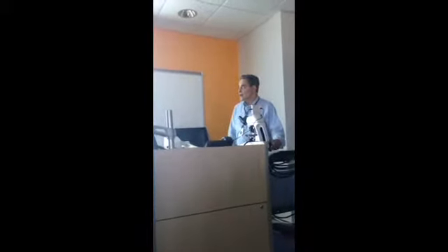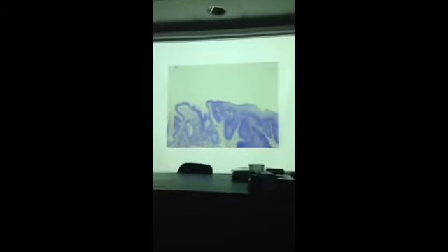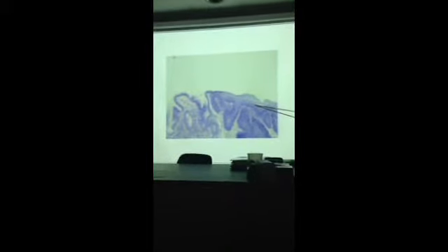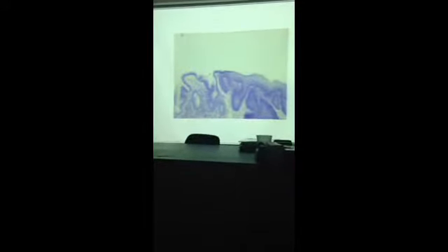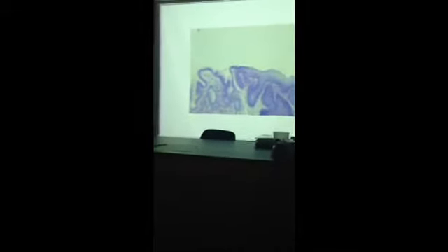Okay? All right, so here we have the junction between the esophagus and the stomach. And this is where we see the change in epithelium. On the right, what kind of tissue? Non-keratinized stratified squamous, like we saw lining the tongue in the oral cavity. Okay, multiple layers of flattened cells. Again, you can tell by the multiple layers of flattened nuclei.